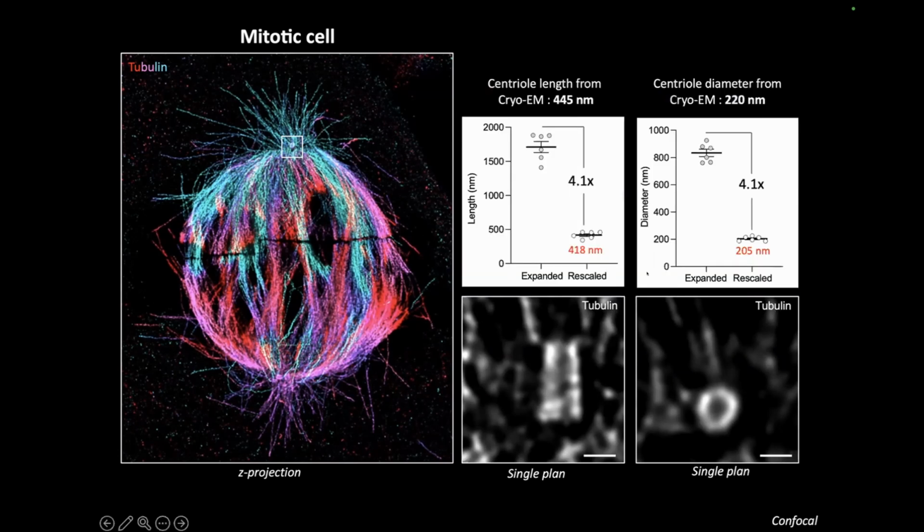And we used this also to show that the expansion of this organelle was not altered by the fixation. So I could show that both the length and the diameter of this centriole, when compared to cryo-EM data of this organelle, was completely fitting with a 4x expansion.